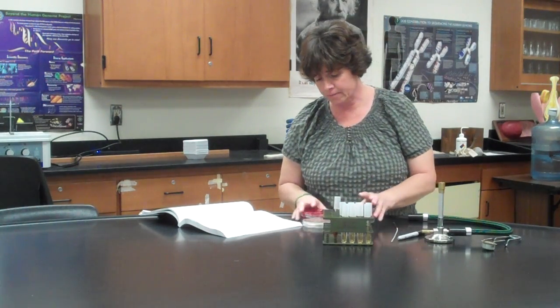Okay, so I was correct in counting. We have 8 different bacteria, which are going to be in broth tubes. And then we have 6 different plates here. So what you're going to want to do is follow the directions exactly.